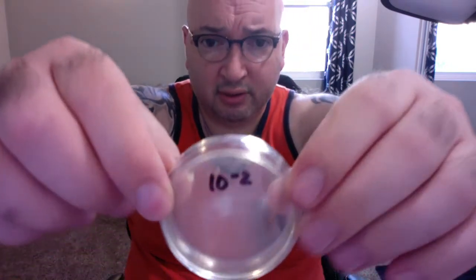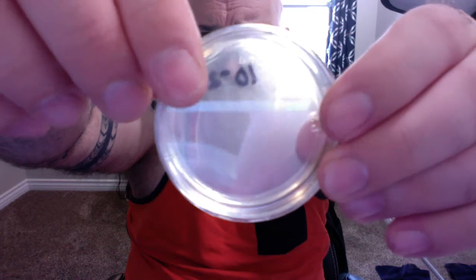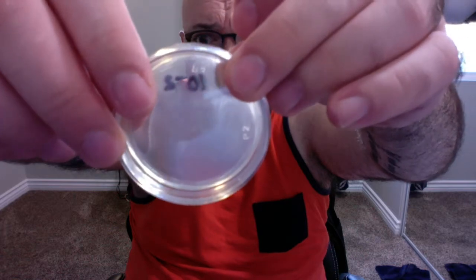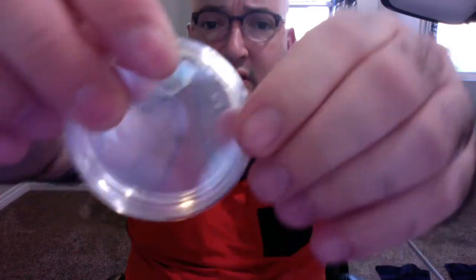Okay, so dish number 2 looks a bit similar to dish 1. Some very mild growth up here. Let me flip this around. You can see some up here, but not very much happening in this dish, which is surprising. This is dish number 3, which does look quite busy here. You can see quite a bit of growth up here and all along the rim of the dish.